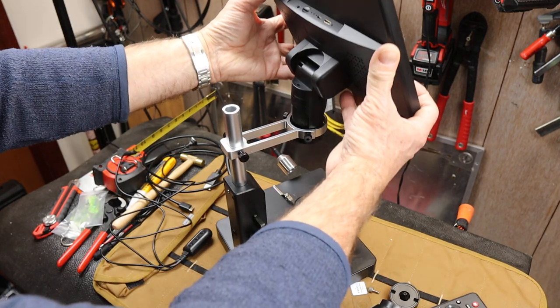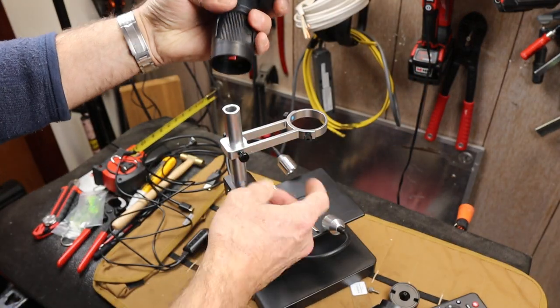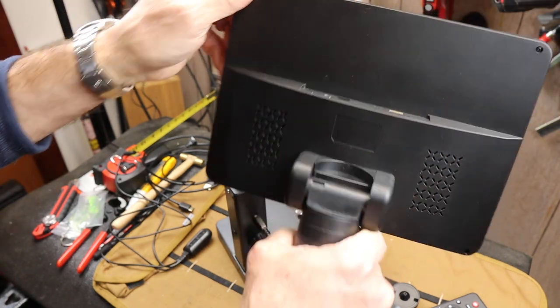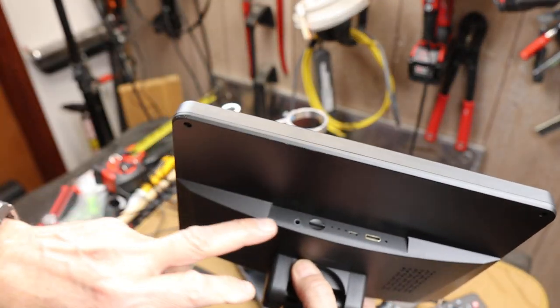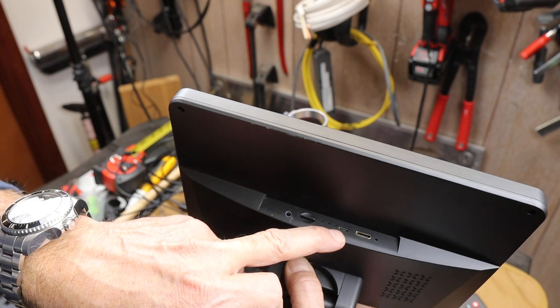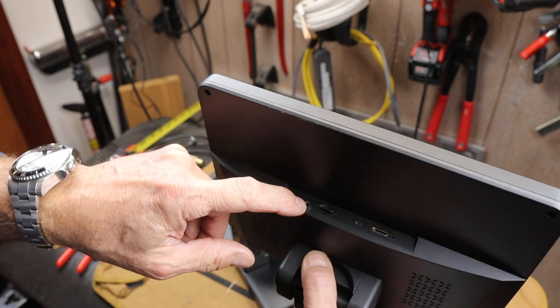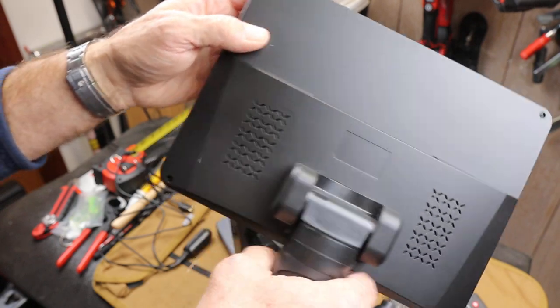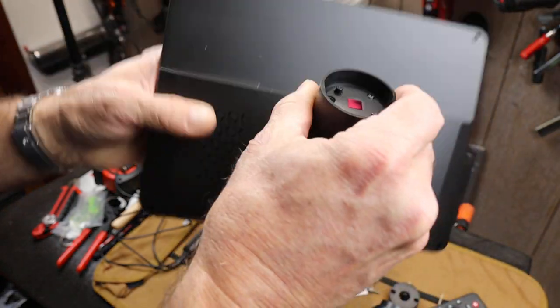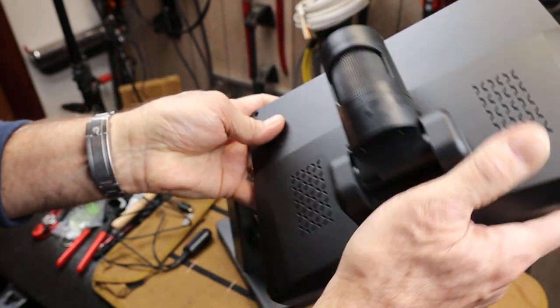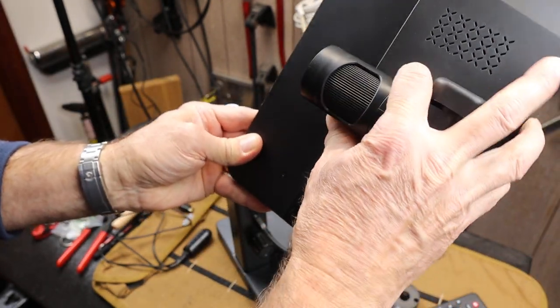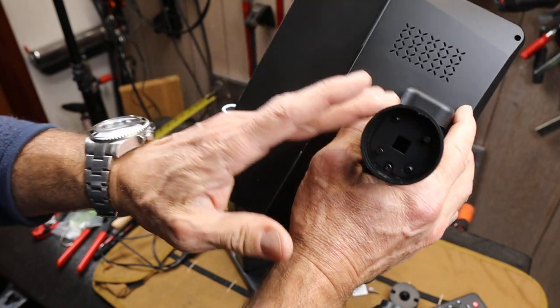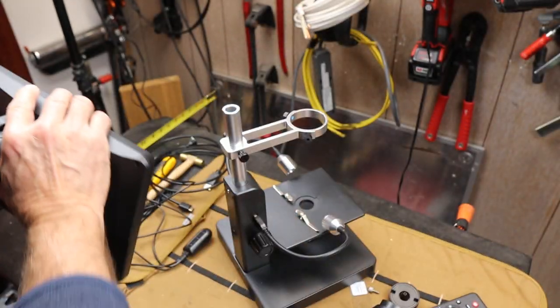So I've got two collar set screws there. Here is the camera. You can see on the back, I've got my HDMI, I've got my power input. This is a micro SD card, and I've got audio in if I want. Here's the focus collar. And you can see there are different ways that I could operate this, depending on the positioning of the lens. So that's pretty cool.